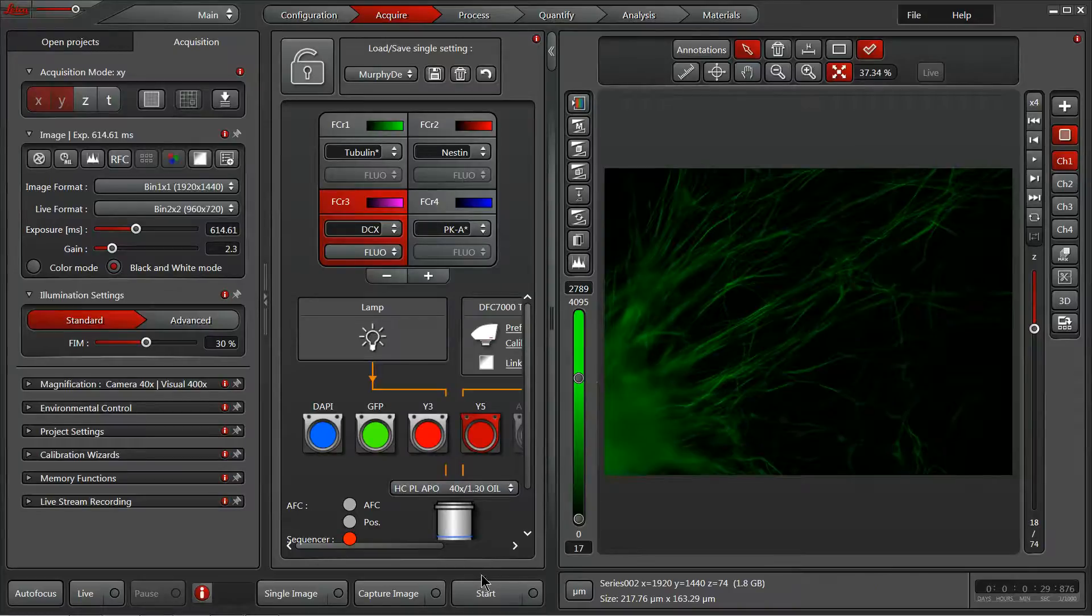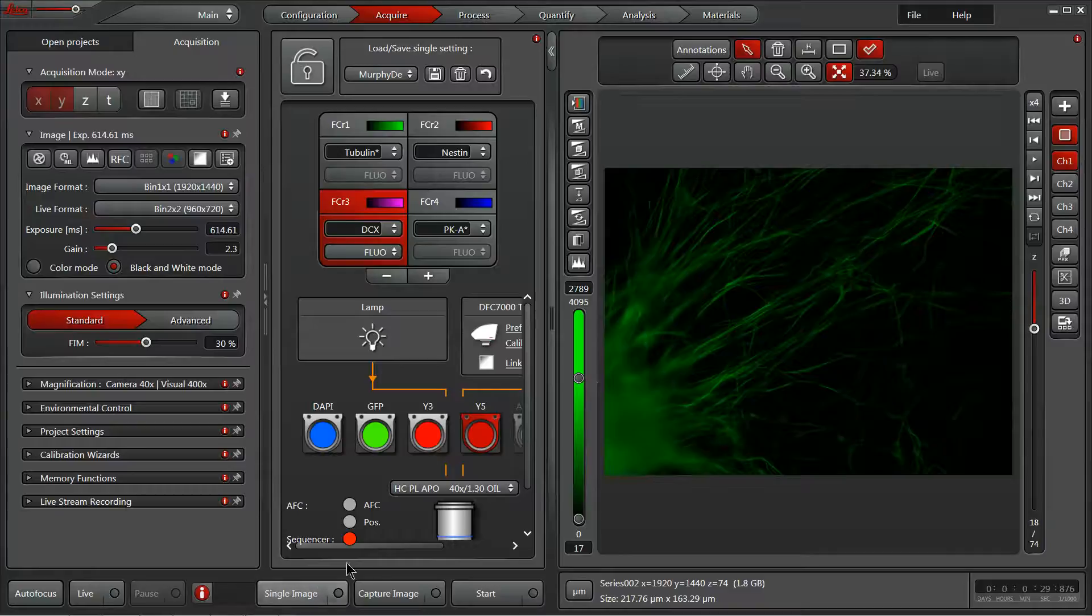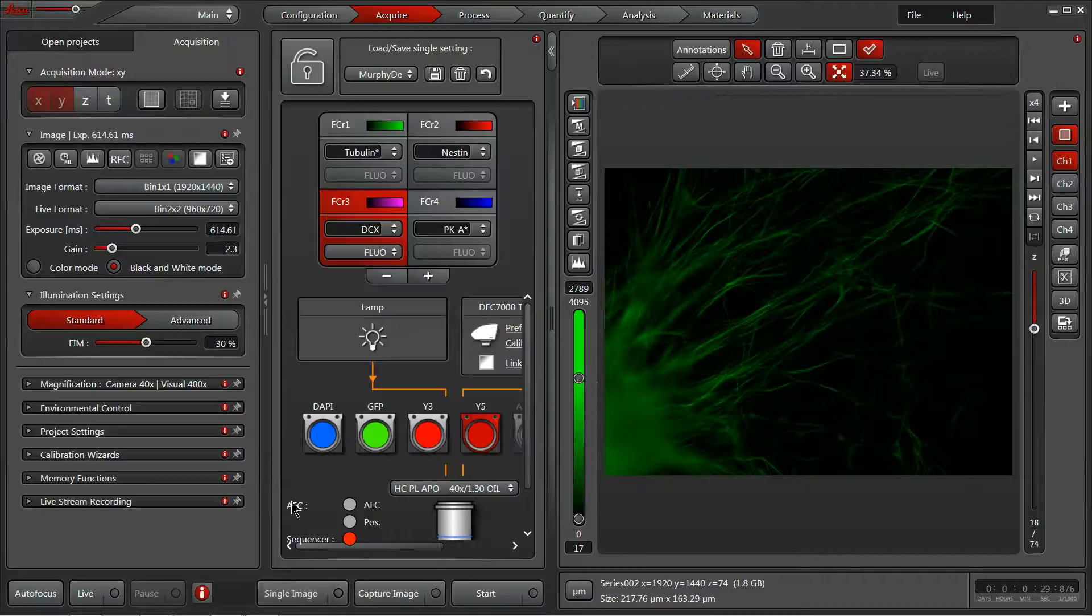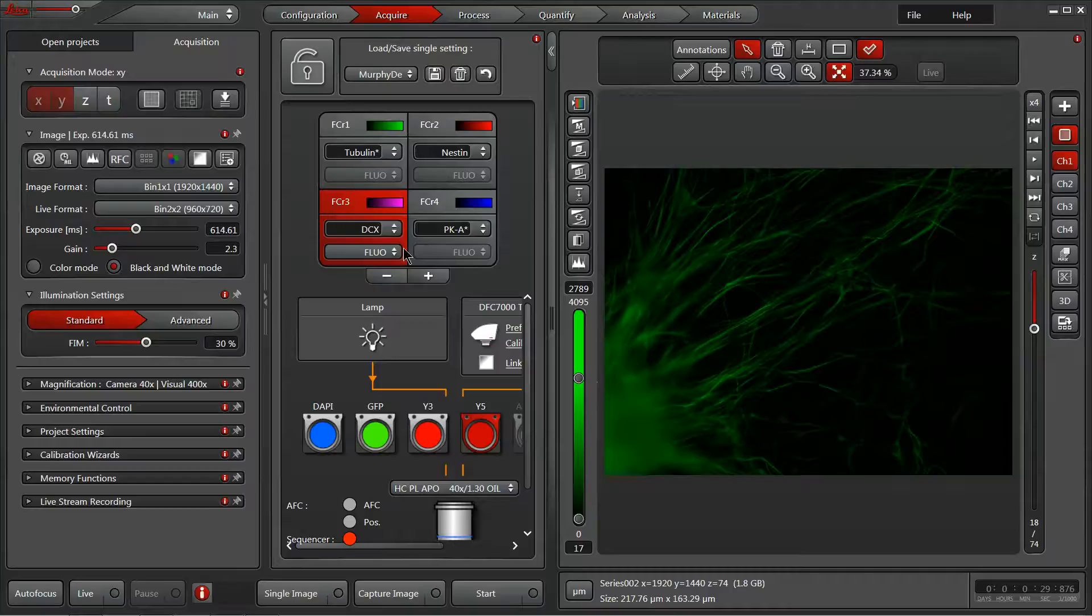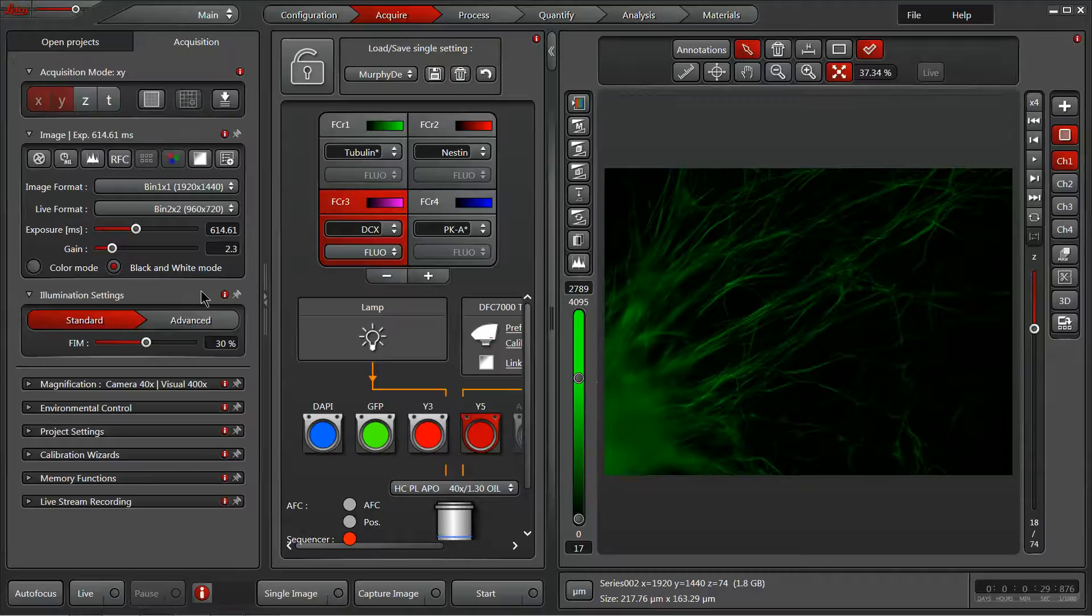Across the bottom of the center panel we have three different acquisition choices. We have a single image capture which will take a single channel that you have selected only, so it will ignore the additional channels as well as the additional dimensions that you have selected as part of your experiment.